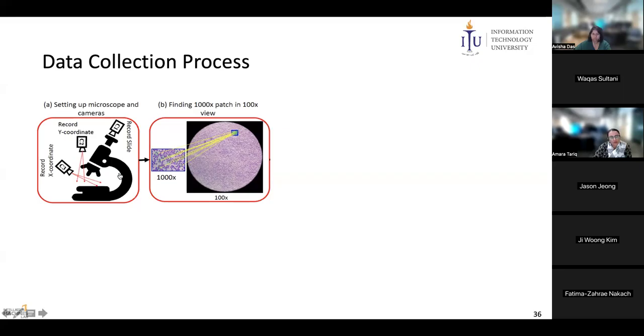So what we did is that given the cell, we actually tried some deep learning method, it doesn't work out, and then we tried this simple SIFT based matching, and it really works for these specific images. So we compute the SIFT features and then they do the matching, and then they find the patch here.